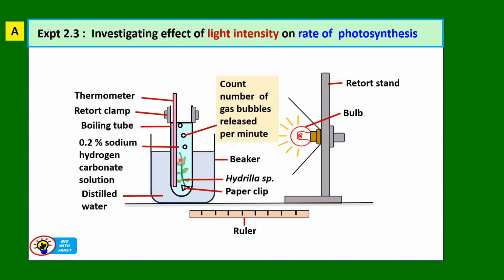Okay, then you're ready to start counting the number of gas bubbles produced in 5 minutes. Okay, let's take the time as measure the number of air bubbles released in 5 minutes. For some cases it could be every minute or every 2 minutes, and so forth, depending on the question. So read the question carefully.